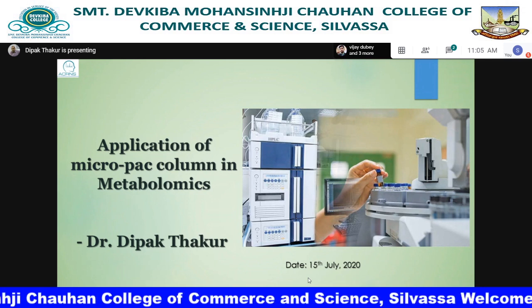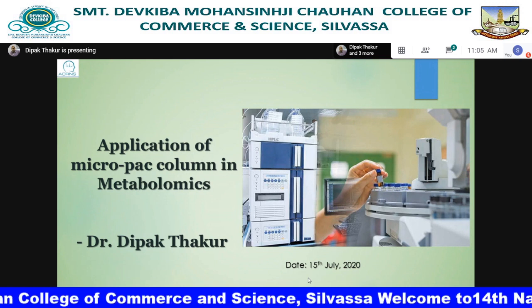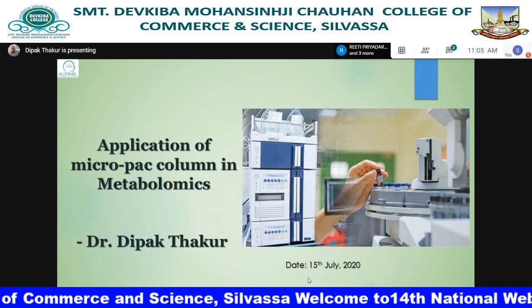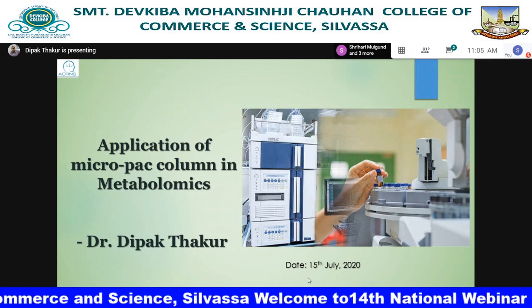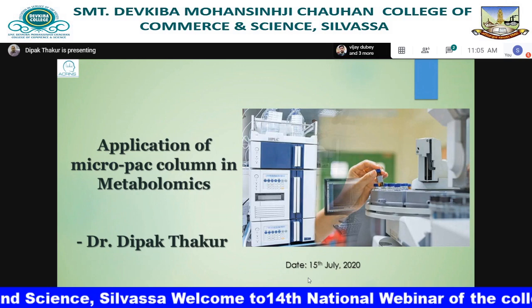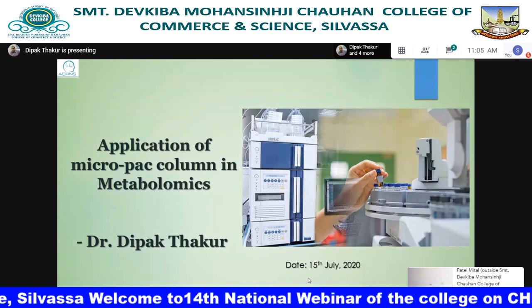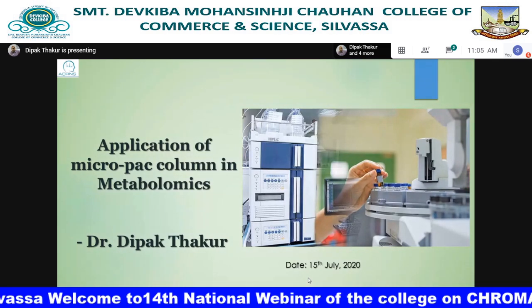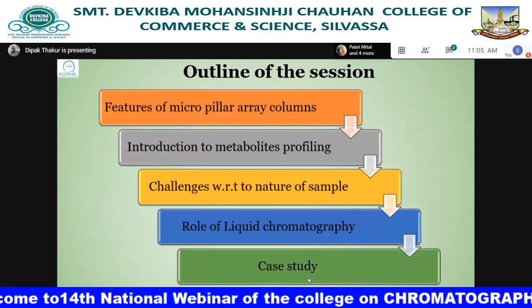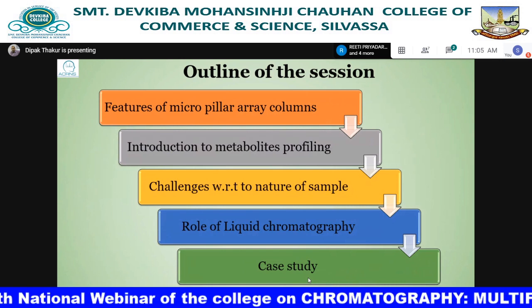However, the trend is towards miniaturization. That is, how can we miniaturize and benefit? What are the benefits of miniaturization? So yesterday we looked at the construction of these miniaturized columns, whether nanoparticle based columns or micro pack columns, which are micro pillar array columns. So to start with, I'm going to mention what we are going to discuss today.